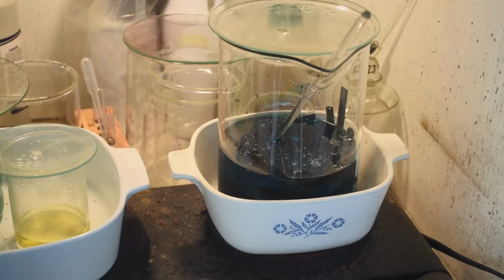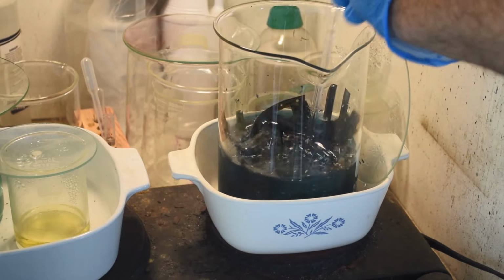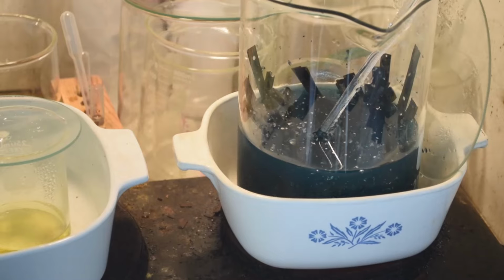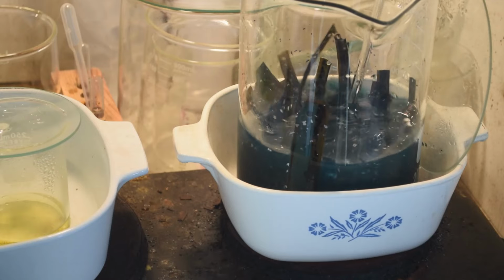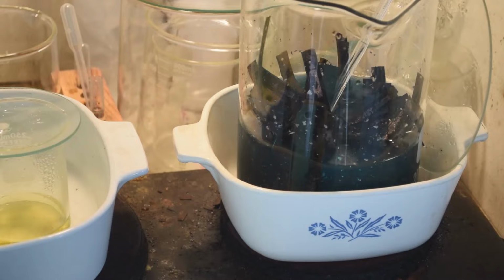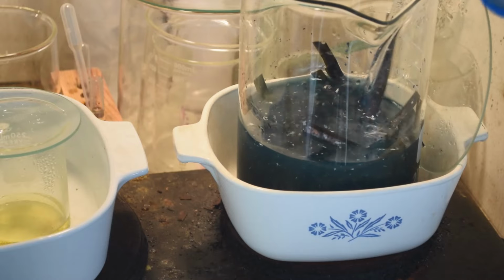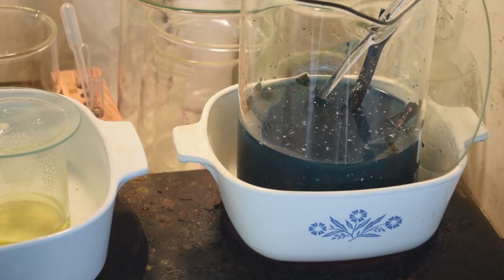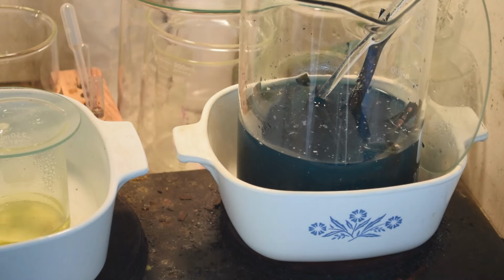Okay, so you're probably asking yourself, where does all that leave us with this stuff right here? Well, I think, yeah, look at all the stuff in there. Yeah, I think what I want to do is use a physical process rather than chemical process to separate the palladium from the waste material here. And you can still see some copper on there, on those strips, which is good. Copper present on the strips is keeping the palladium from going into solution. So, yeah, I'm going to use a physical process similar to what I use when I'm working with gold fingers, where I dissolve the underlying metal and then physically separate the gold from the waste material before refining the gold. So I think I'm going to try the same thing with this.